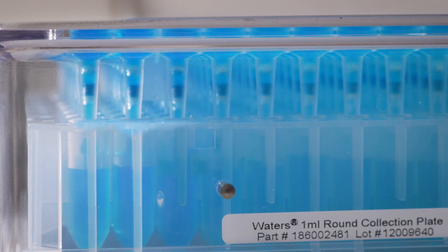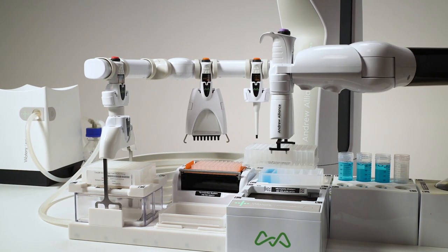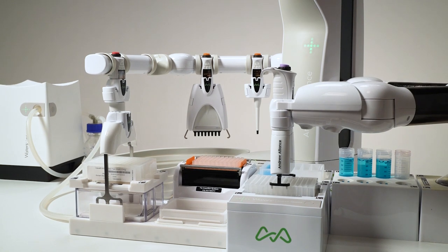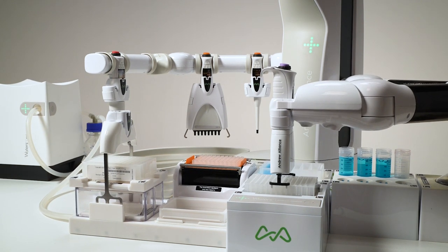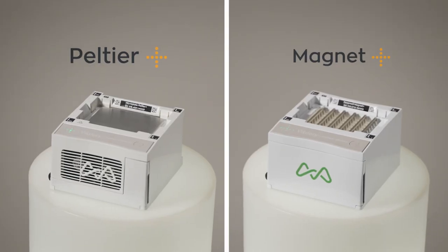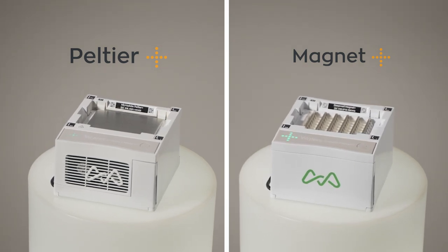The result is a seamless automated procedure from start to finish, with the flexibility of expanding and scaling up your workflows made possible thanks to a variety of connected devices all working together. Need to add thorough mixing in between steps? No problem, add a Shaker Plus device to your bench. Need a temperature-controlled incubation or a magnetic bead-based cleanup? Just add a Peltier Plus or a Magnet Plus device.